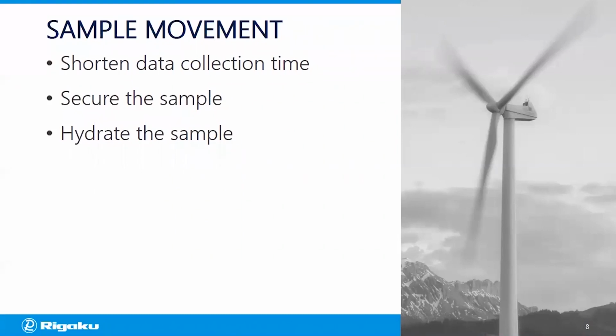And we also know if we take a cutting from a plant, the plant will lose some turgor pressure or stiffness, and it will start to dehydrate or wilt. So we'll have to consider this problem when imaging cuttings. So what can we do?